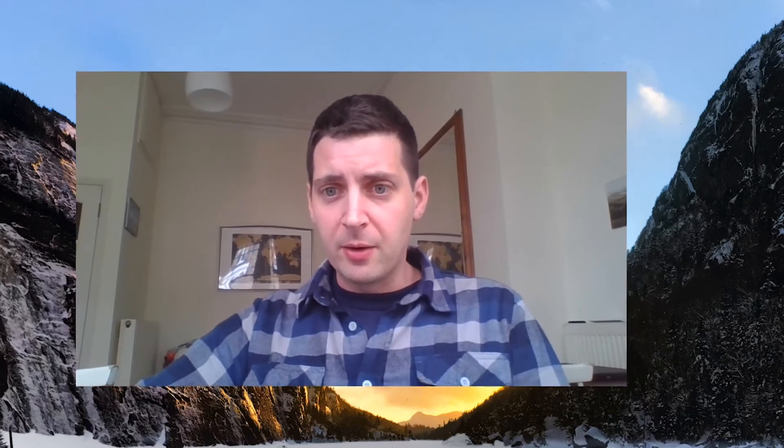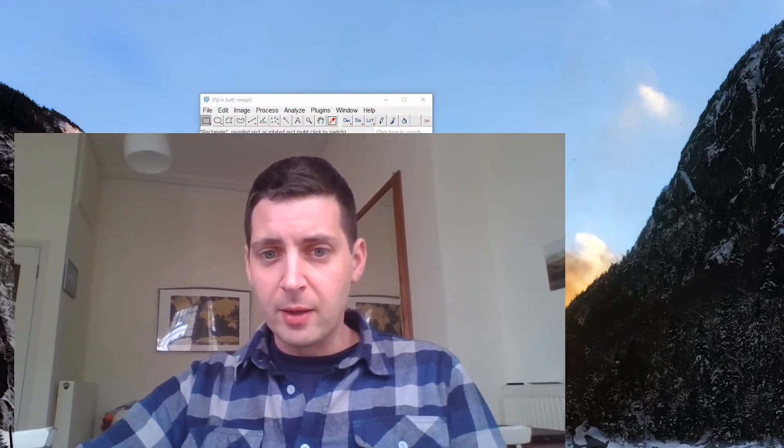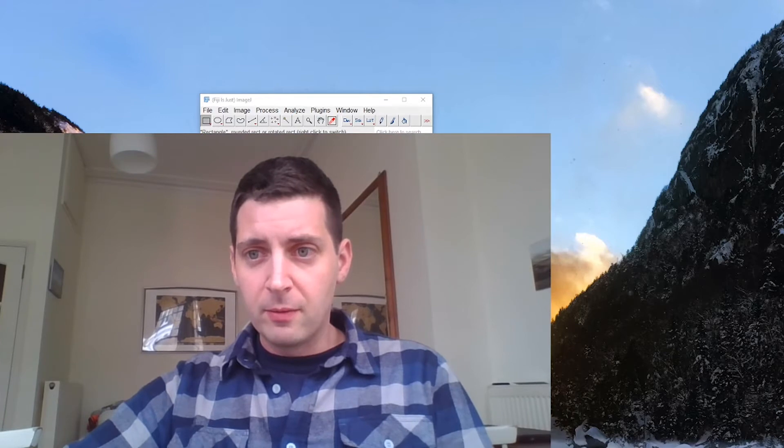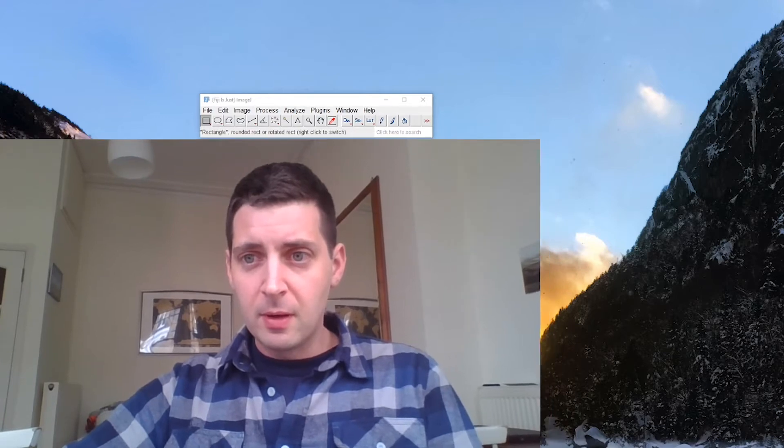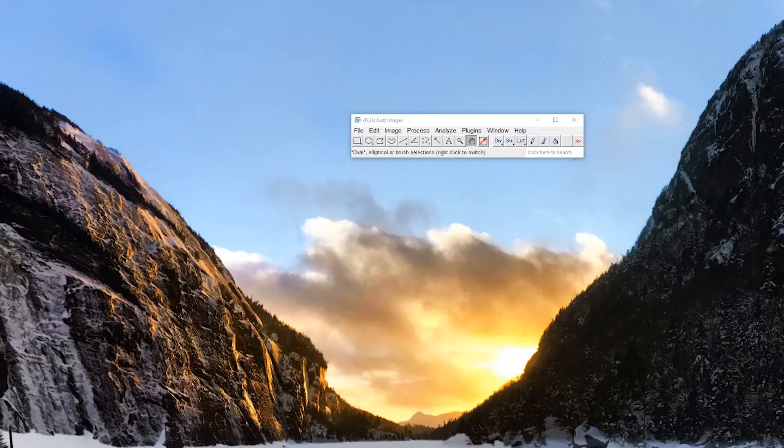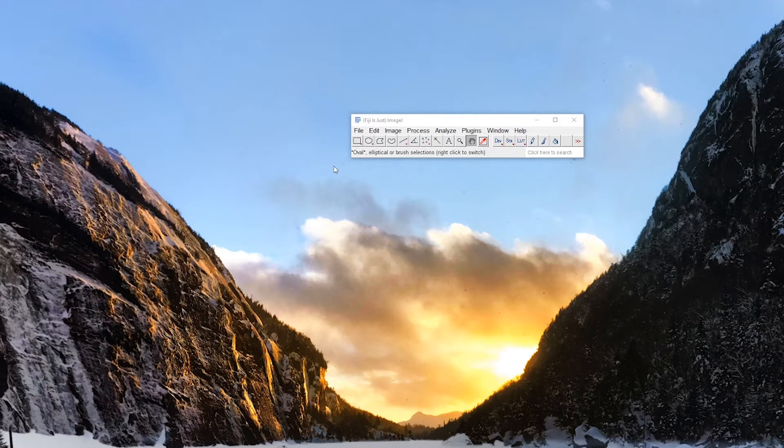So we're going to go ahead now and write a Jython script using the macro builder at first to figure out what we want to do, and write this Jython script to find the average size of the cells that we made in the simulated image. So on that note, I'm going to move myself out of the way. All right, so let's get started on detecting how many cells we have and their sizes.